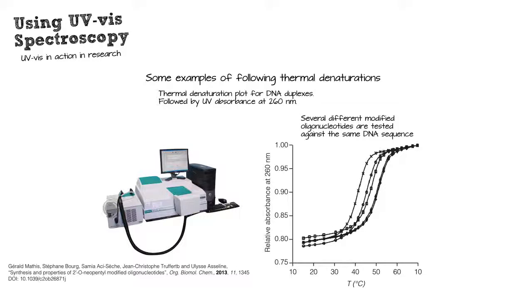Another thing we can do is we could use a UV spectrometer like this one here, this Carry 300 Bio, that has a sample compartment where I can control the temperature, and I can raise the temperature very slowly. And I can watch DNA separate from a double-strand to single-stranded form, and the absorptivity changes as we go from the double strand, which is highly organized, all the bases stacked on top of each other, to a single strand, where all those nucleobases are more mobile in solution, less organized, and more free to absorb light individually, rather than somewhat quenching their total absorbance by being stacked up.